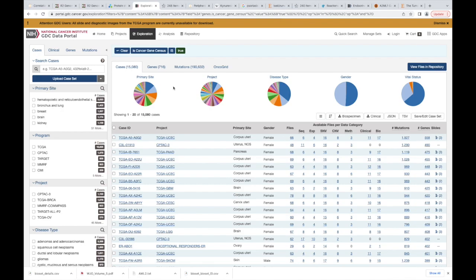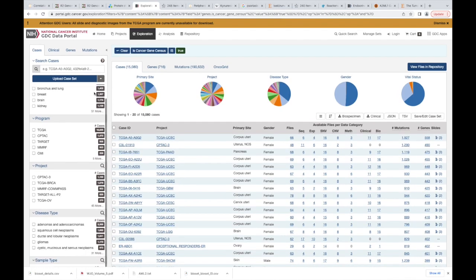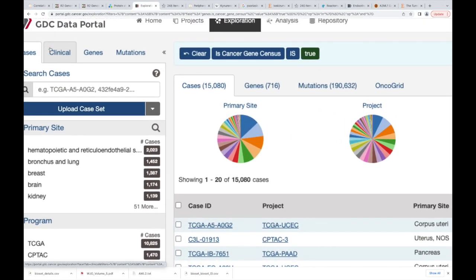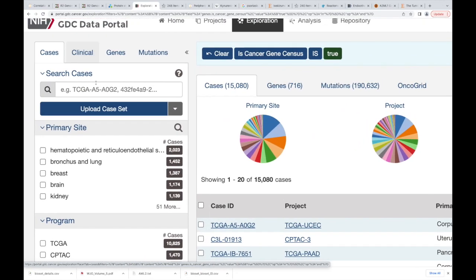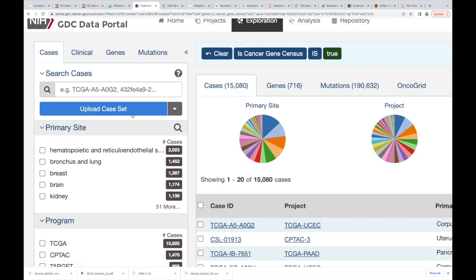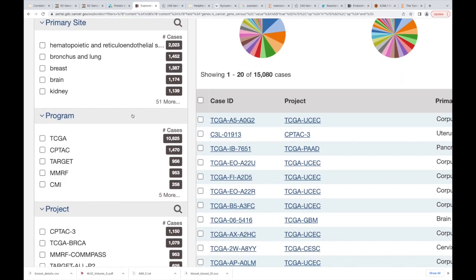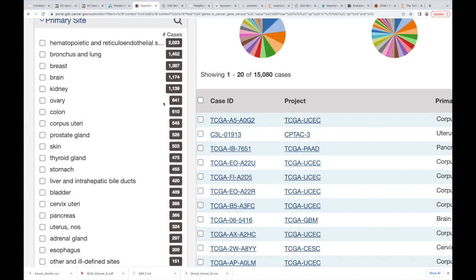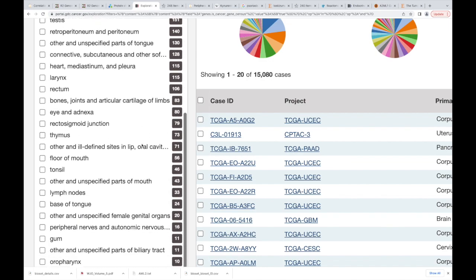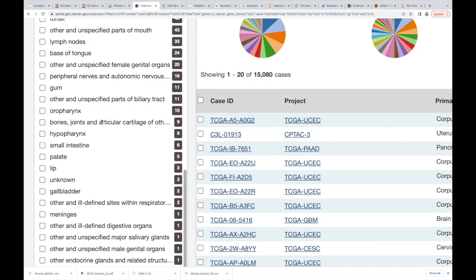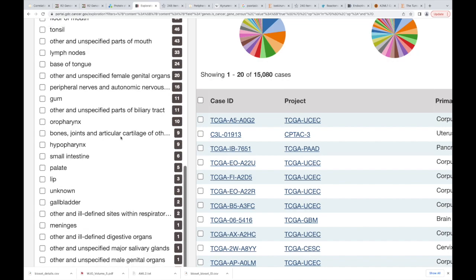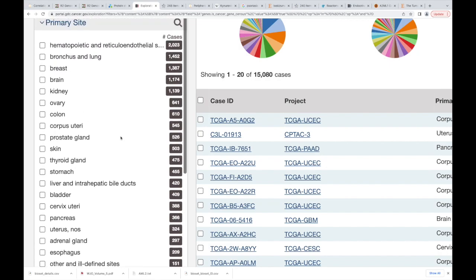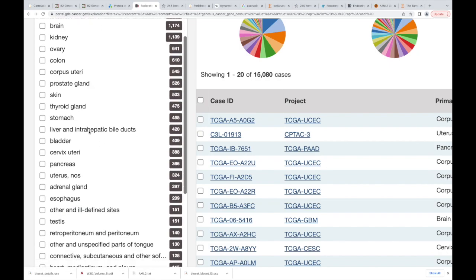Here's what we can do: let's just kind of take a look here. Here on my left you can see this first tab, Cases. Everybody see that? So here's what we're going to do - let's go down here, we can see all the types of cancer they have. Even in these different kinds of cancers, there's definitely other things you can look at as well.